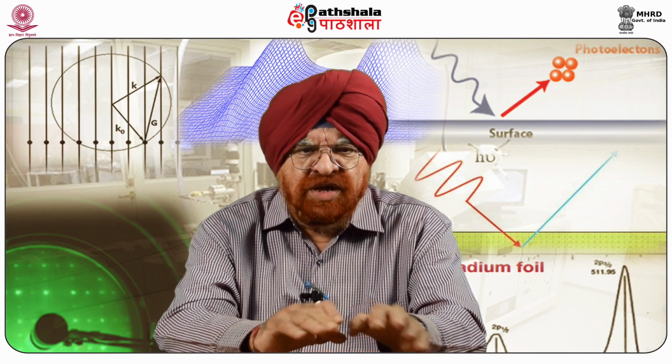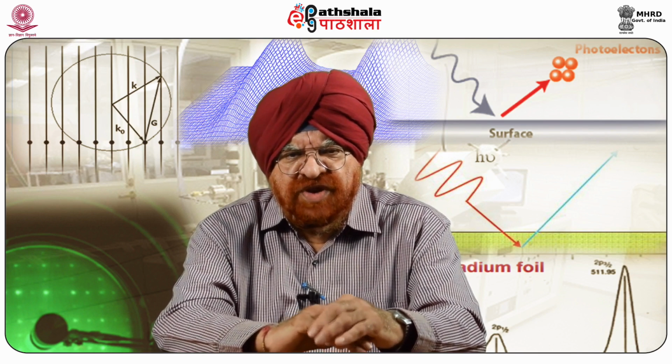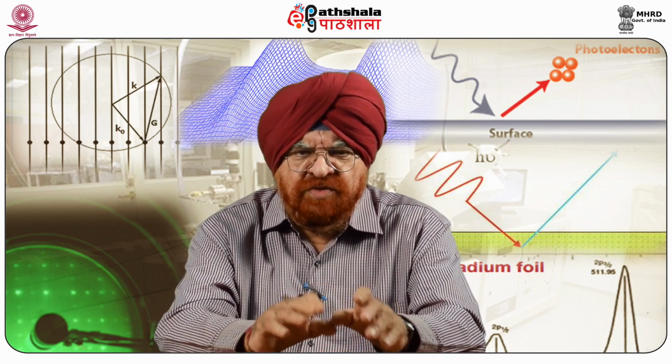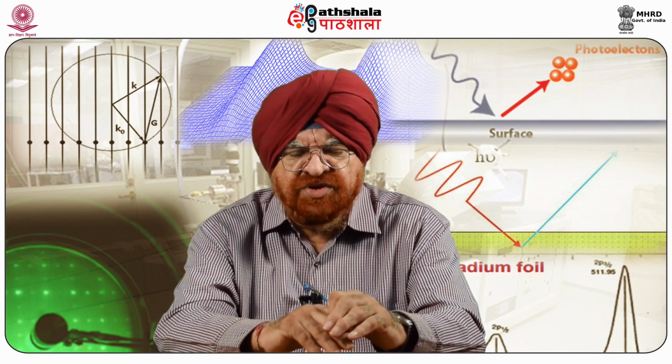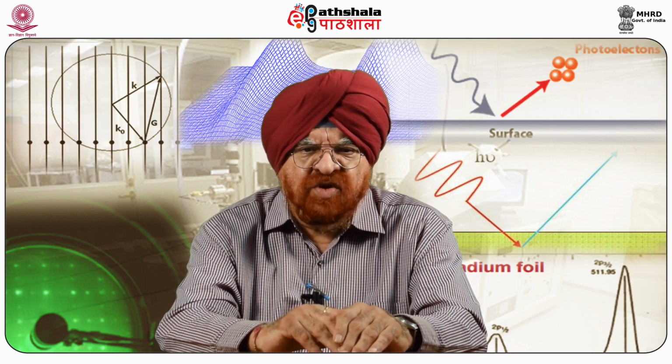Well, when we talk about the introduction, X-ray photoelectron spectroscopy, XPS, also known as electron spectroscopy for chemical analysis, ESCA, is the most widely used surface analytical technique. XPS and ESCA are both one and the same thing. It is used very widely because it can be applied to a broad range of materials and provides valuable quantitative and chemical state information from the surface of the material being studied. The average depth of analysis for an XPS measurement is approximately 5 nanometers.